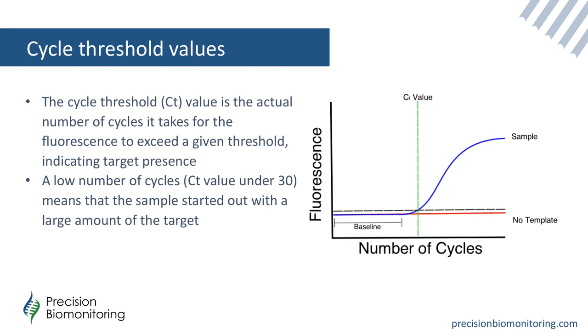The black line is the threshold setting. That threshold setting will either be automatically calculated by the machine or manually set based on the assessment of the test. So that's something else that can vary depending on the test. You want to make sure whatever test you're selecting, you have an understanding of how that threshold should be set, because it can adjust results for sure.